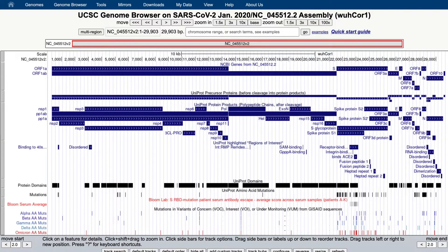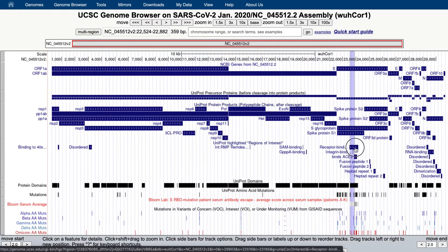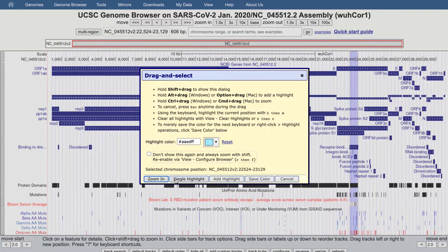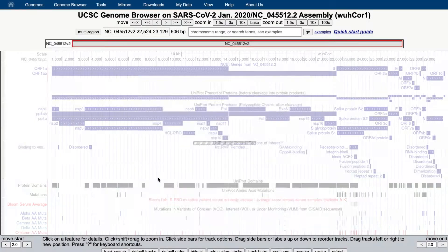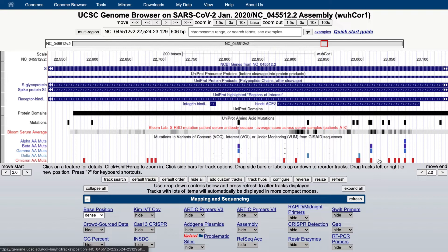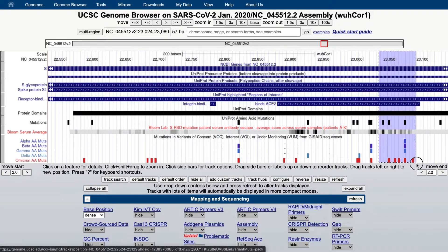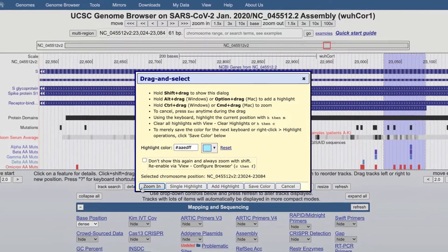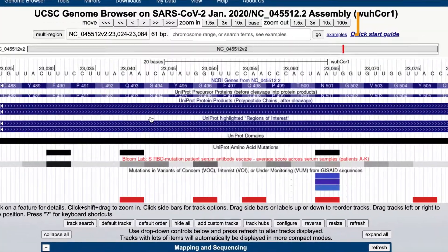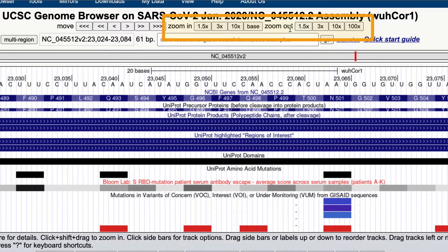You can view annotations at any level of resolution, from the entire genome down to a single nucleotide. You can shift-click and drag over a region of interest to zoom into it, or you can use the zoom buttons above the image.